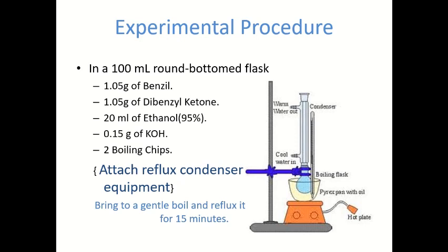Again, you need to attach reflux condenser equipment and bring it to a gentle boil and reflux it for 15 minutes.